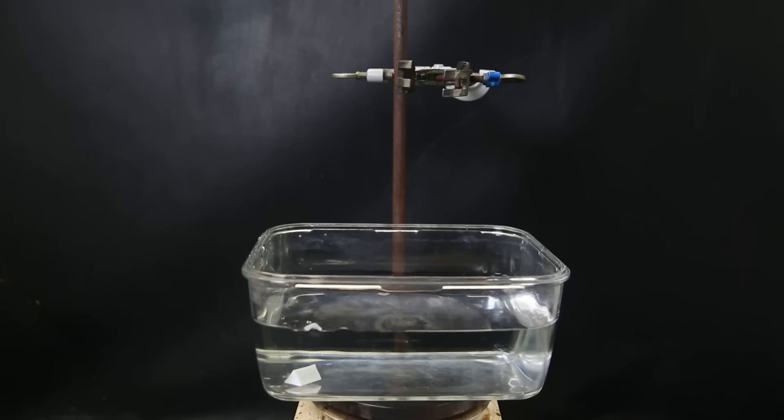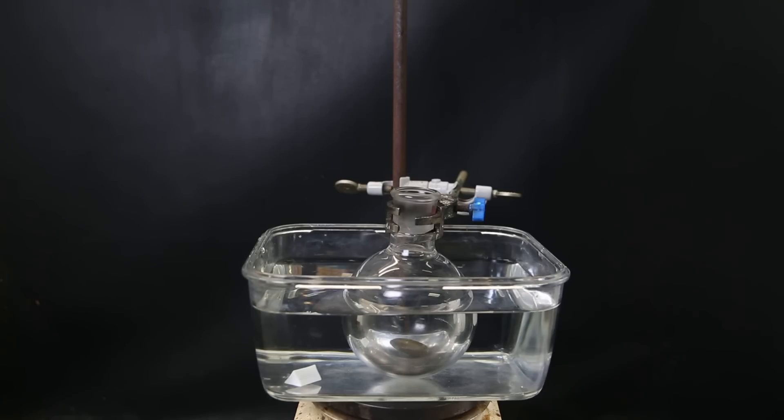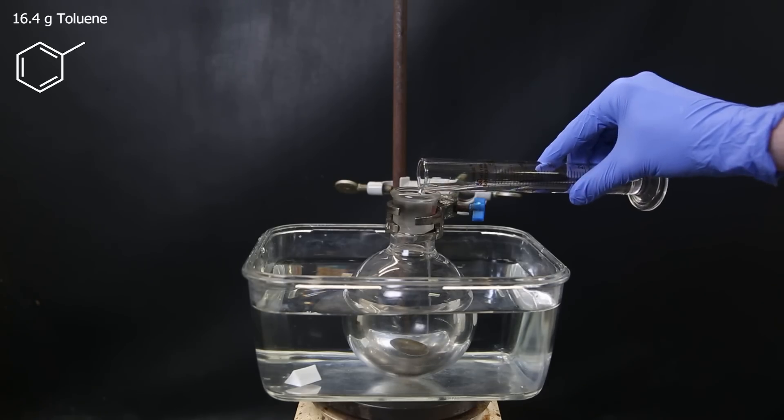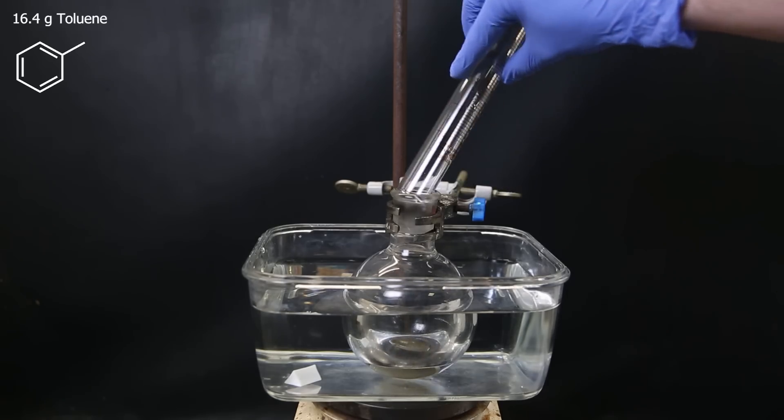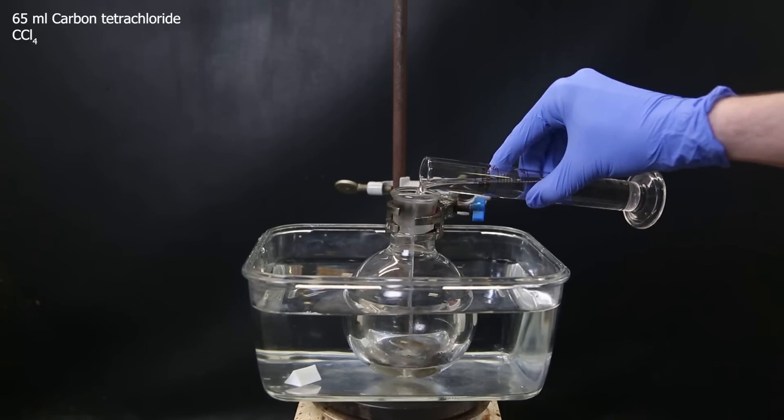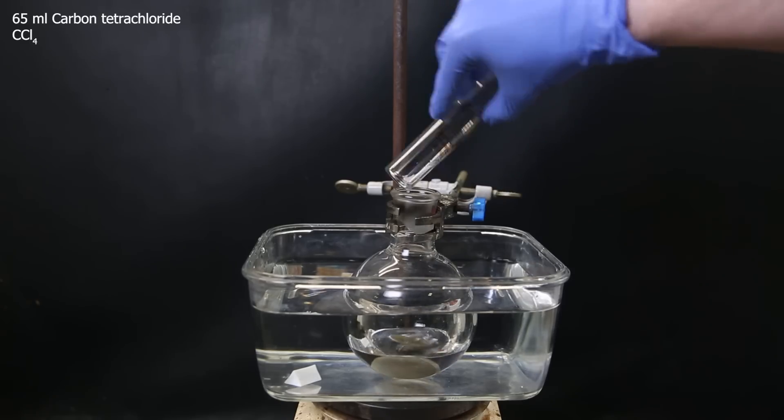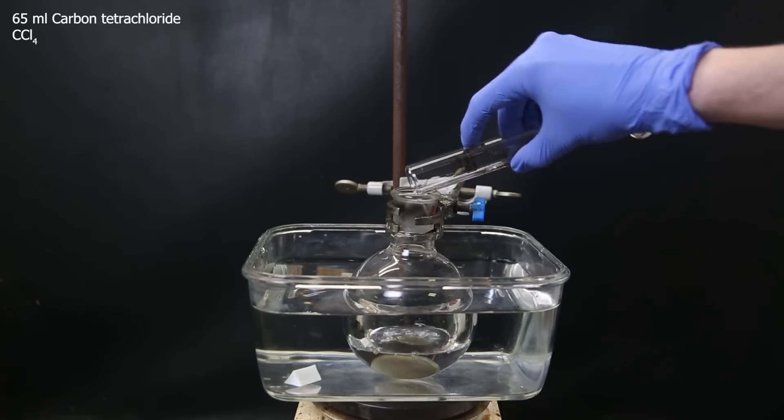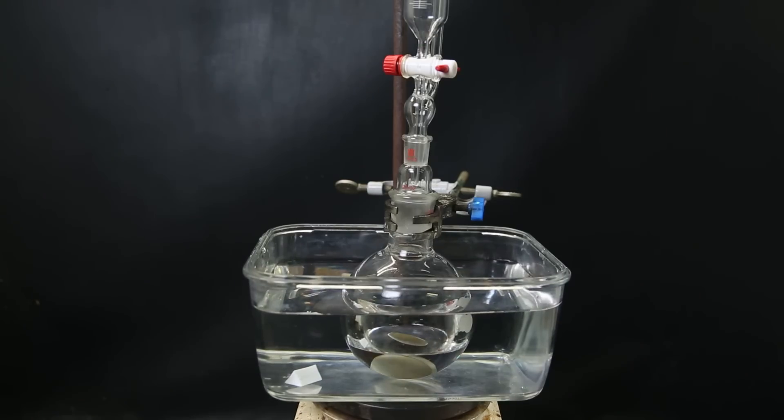So to get started, I set up a water bath and put in a flask with a stir bar. To that, I add 16.4 grams of toluene, and then 65 mils of carbon tetrachloride as a solvent. I attach an adapter with a small dropping funnel, because unfortunately, I broke my big dropping funnel.